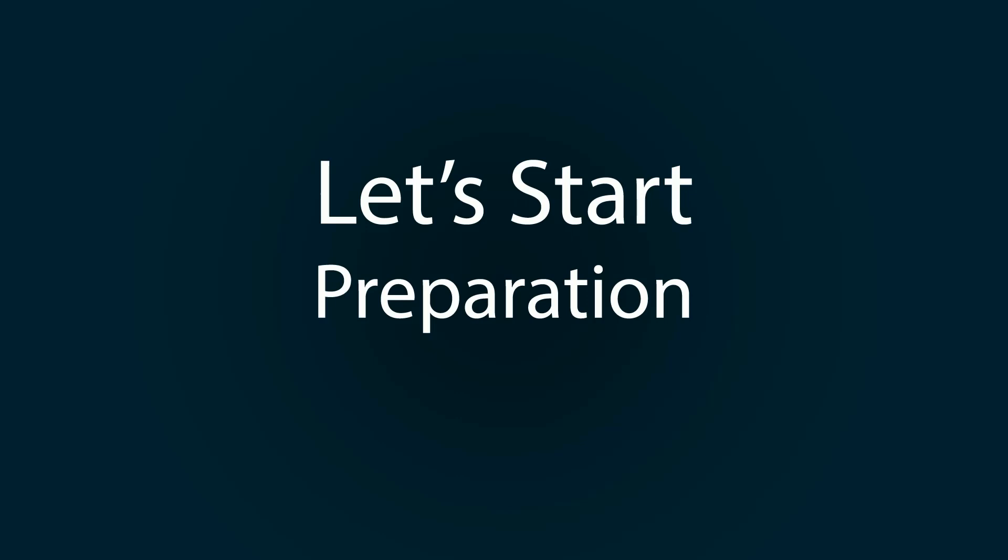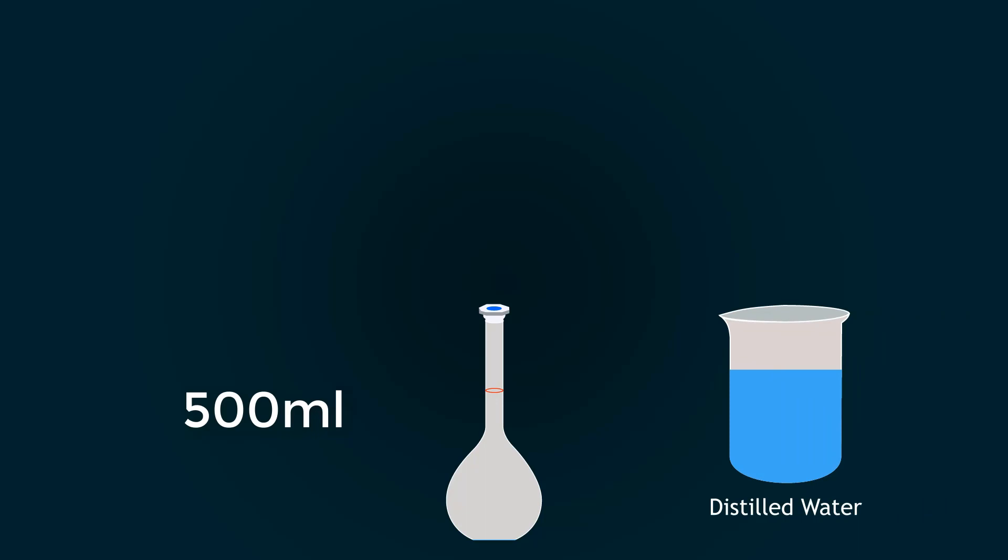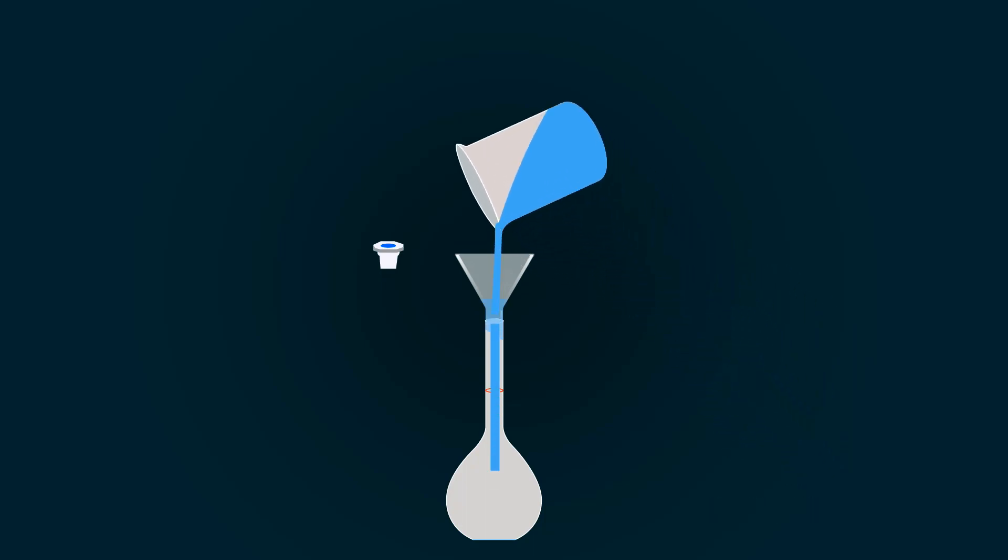Let's start preparation. First of all, take a 500 milliliters volumetric flask and add some distilled water into it with the help of a funnel. Please avoid adding hydrochloric acid directly into the flask, because it may harm you or the flask.